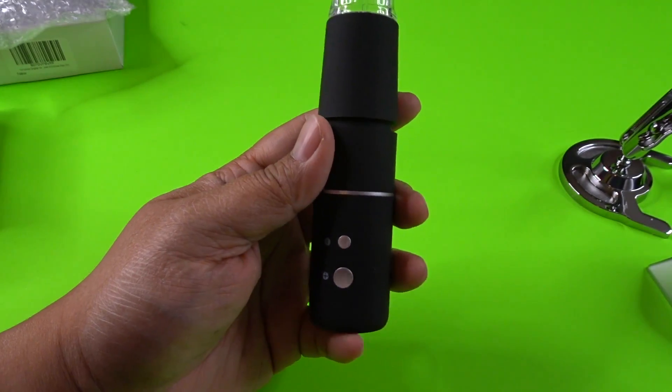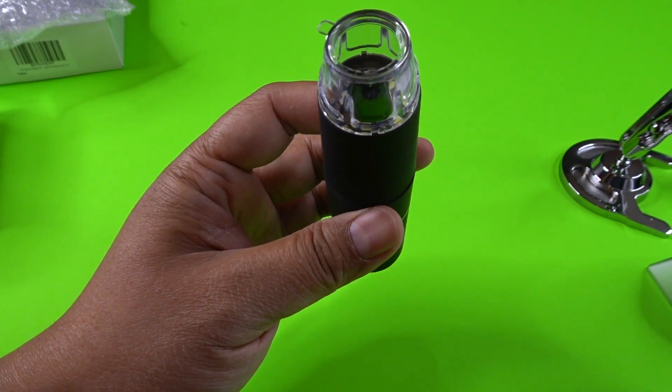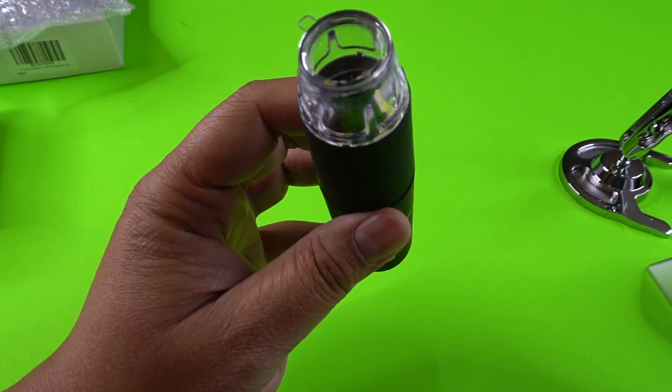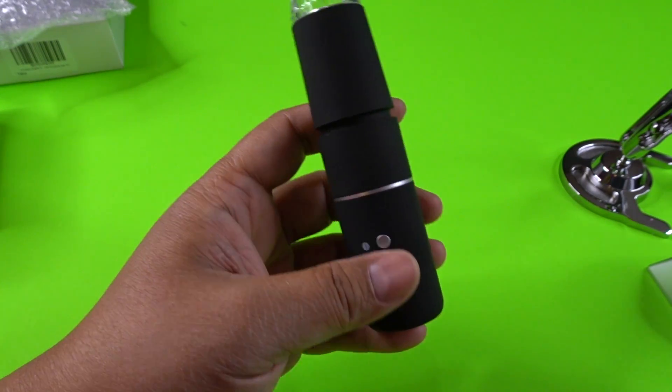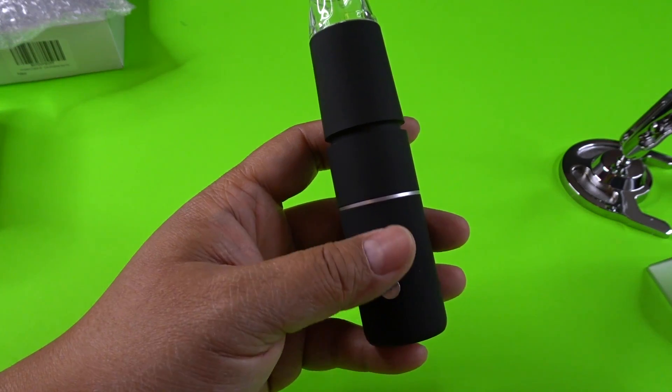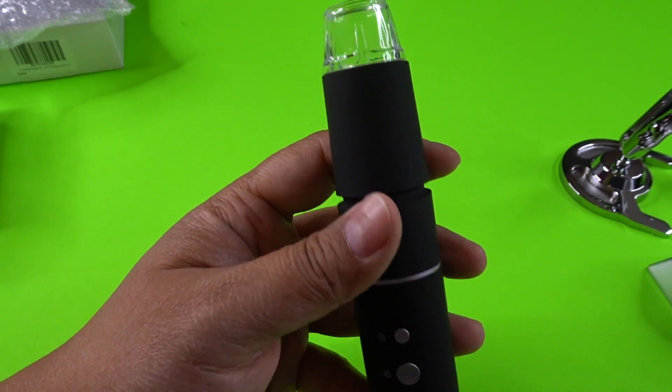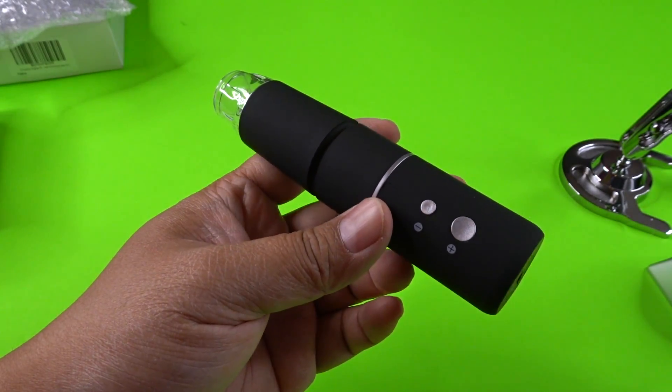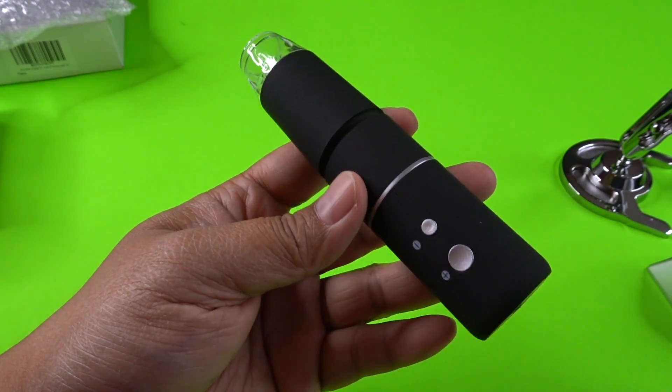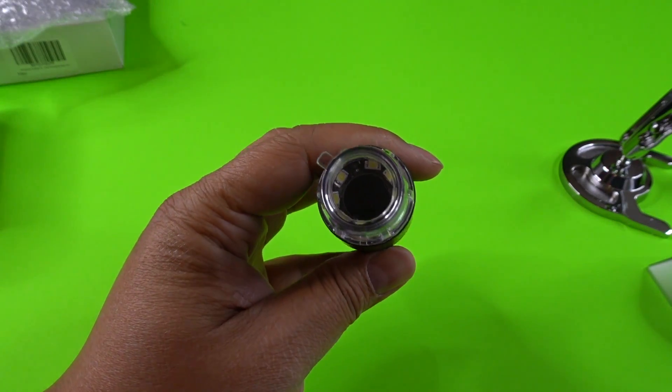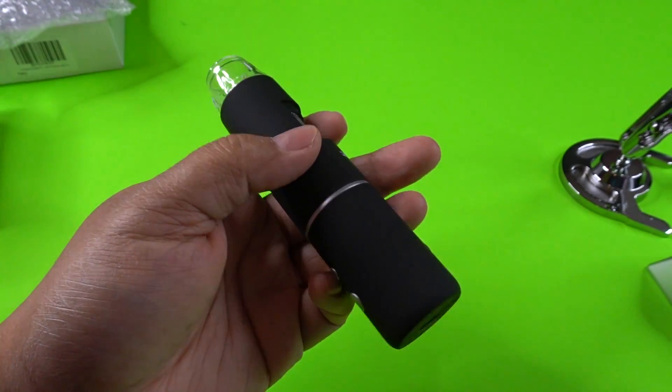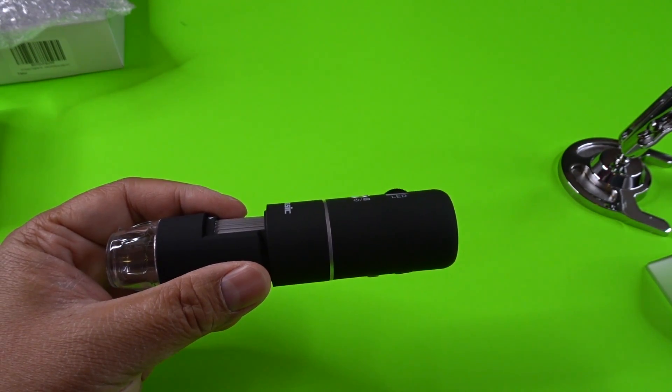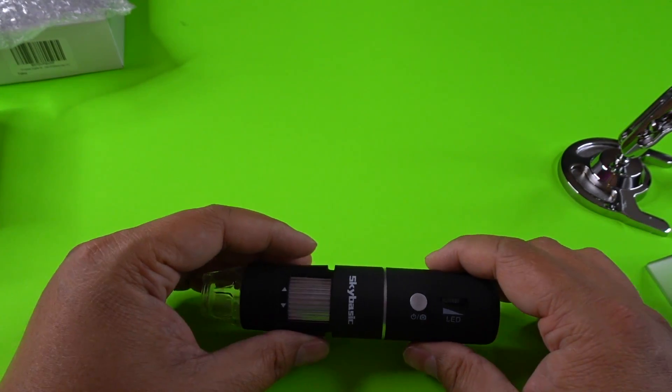So you may ask why you might need a microscope like this. But this is great for looking into details of any computer circuitry boards. Inspecting jewelry. Inspecting prints. Money. Just learning. Exploring. Looking at bugs. Or really anything. Even your skin if you want to film that. So let me go set this up. And let's see if we can get a sample video footage. I'll be right back.